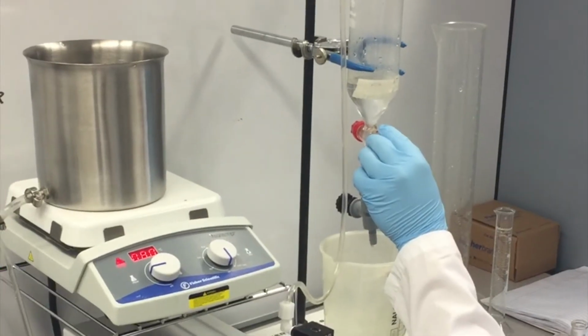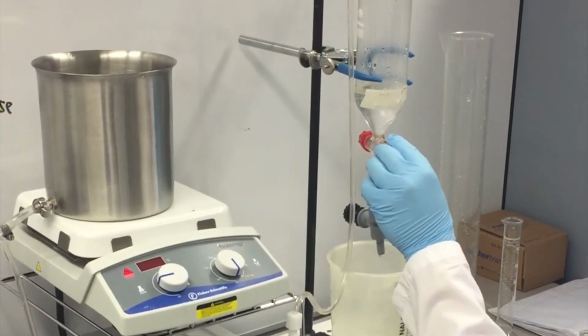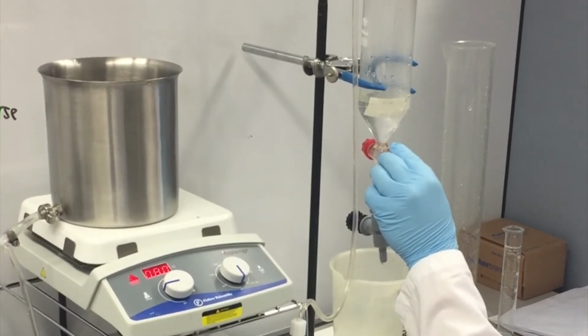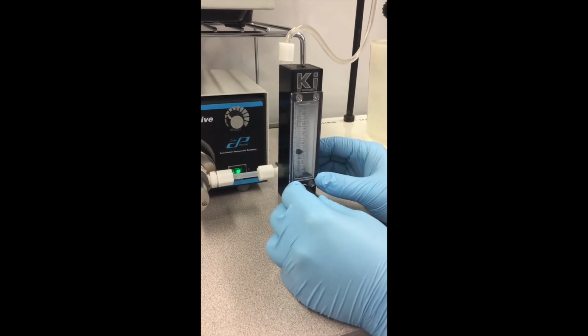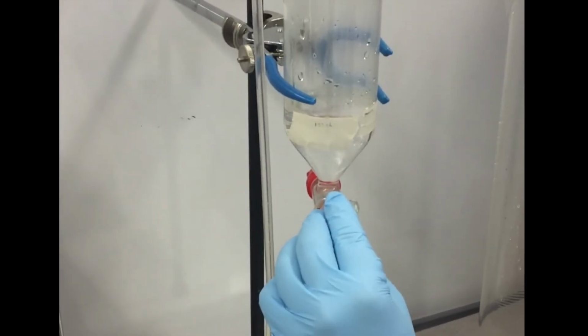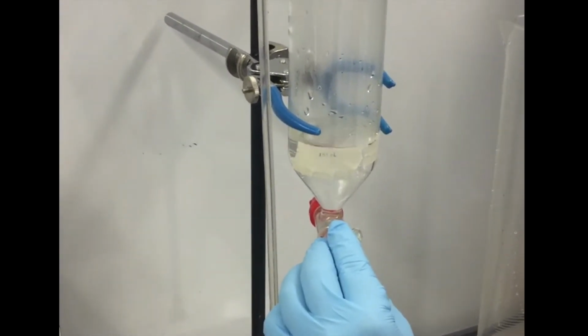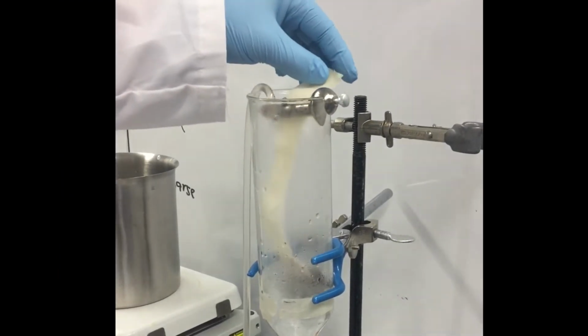The next step involves heating DI water on a hot plate to a desired temperature. After the desired temperature is reached, the pump is turned on and the flow rate is set. The valve for the collection chamber is kept closed until the desired volume of 100 milliliters is reached. After the desired volume is reached, the valve is carefully opened and the outlet stream is set to about equal to the flow rate of the pump so that the volume stays constant within the collection chamber.